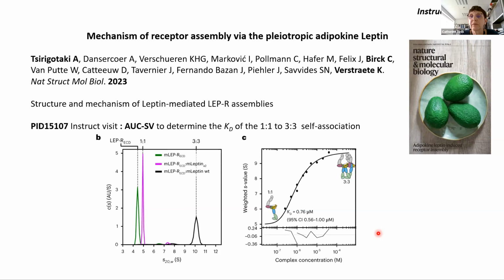Sure. So we have a question from Frank as well. Did you have any protein sticking to the capillary for the FIDA experiment? And how do you get rid of it? Yes, of course. When you always work with surfaces, you have problems of sticking. And in FIDA, it's sometimes the case also, but you have different capillaries, standard capillary and coated capillary, and now a new generation of coated capillary. So it's less and less sticky in some cases, and you can also use detergent and BSA to decrease the sticking, and it works fine. Okay, great.